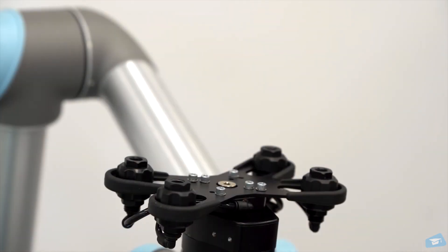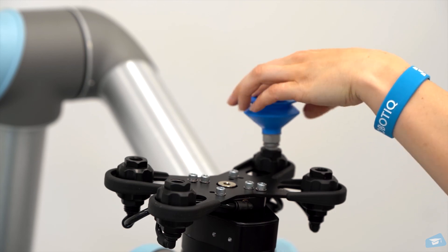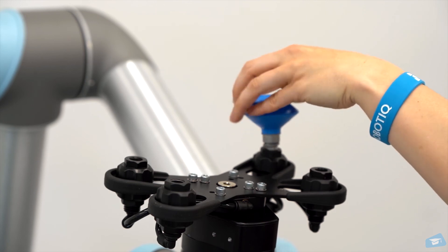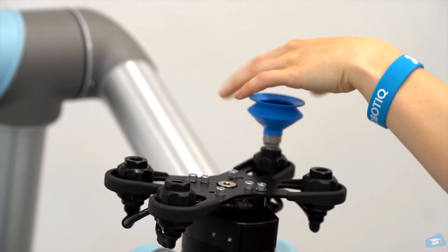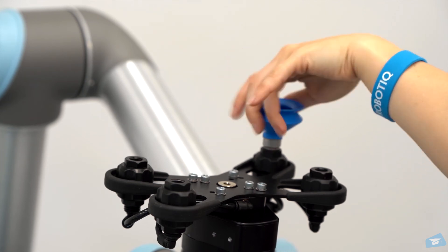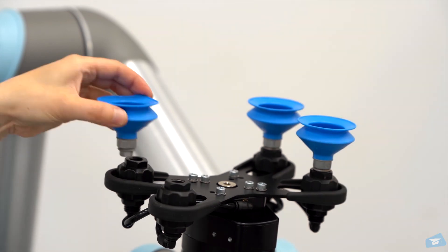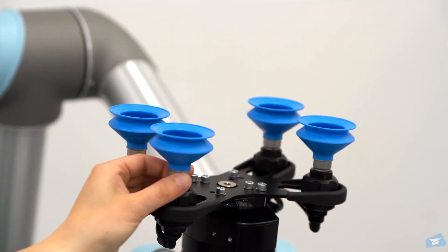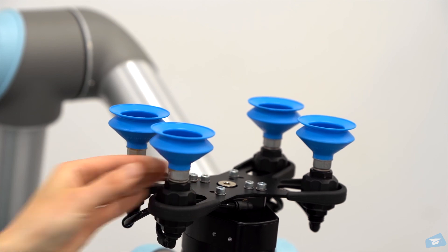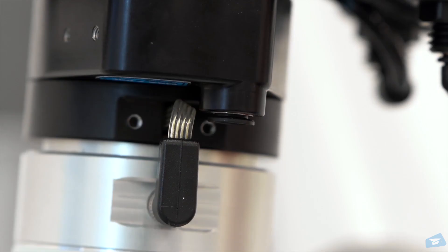Choose the right vacuum cup size for your application and fix them on the Airnodes. The vacuum cups can be tightened by hand. For the suction cup selection, please refer to the suggested recommendations available on our website at robotiq.com.